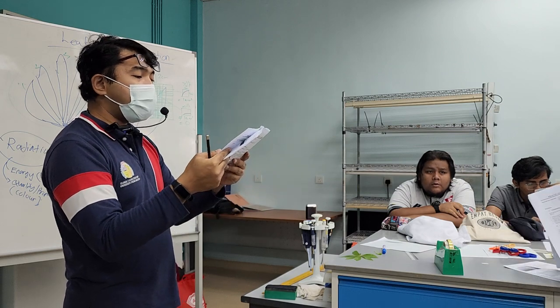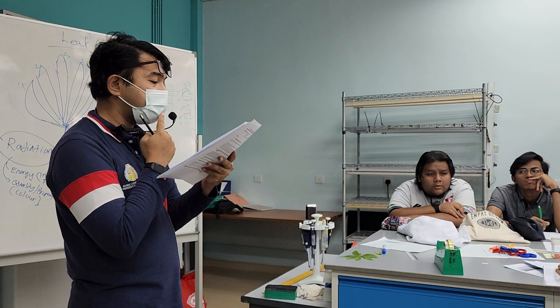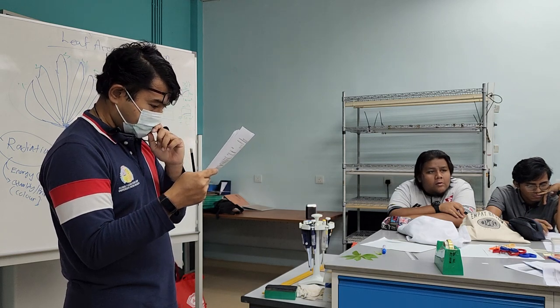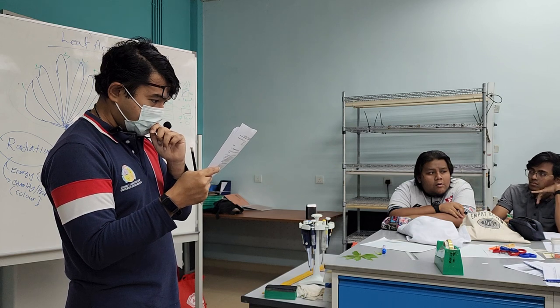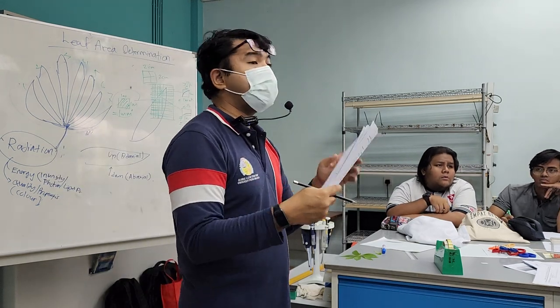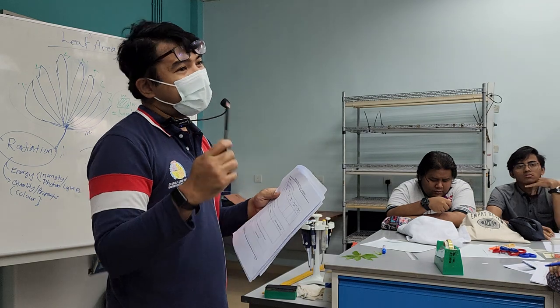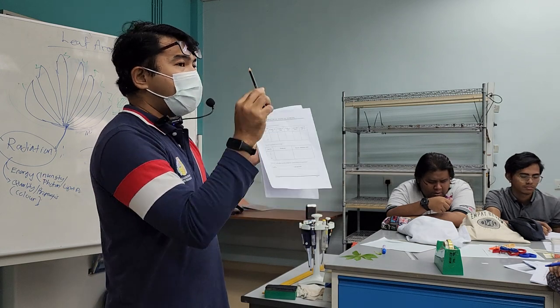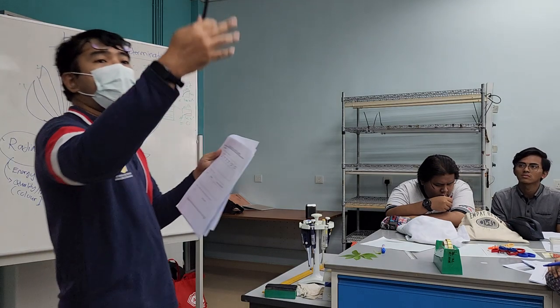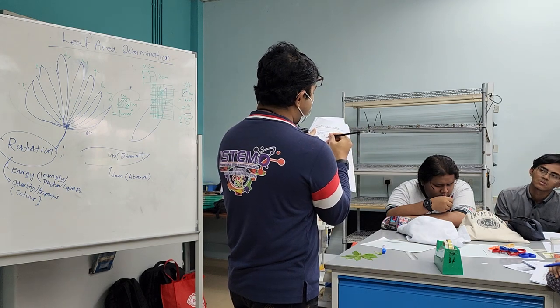Yeah, you know what? I think before you start to do all the tracing and shading, let me see this table 1. I think you need to weigh it first. So this is meant for table one. You need to weigh it first, because if you do the tracing and then do the weighing, that is a bit incorrect, because some of the tissue might have come out from the leaf. So weigh the leaf first, the fresh weight. If it's wet like this, get the paper towel from the roller on the side, okay? Dab it dry and then weigh it. Put down the weight, and then the length of it.